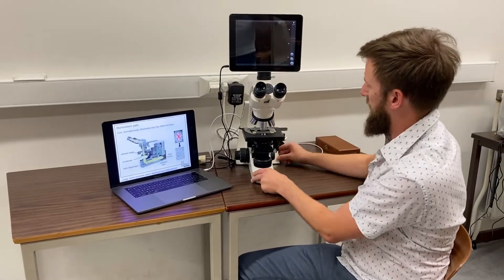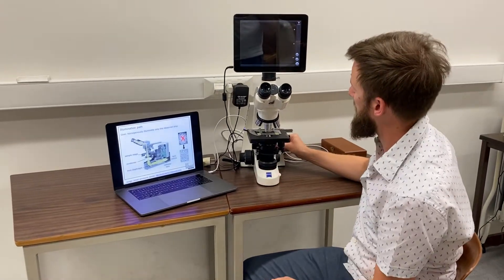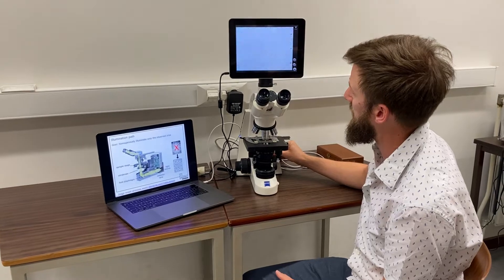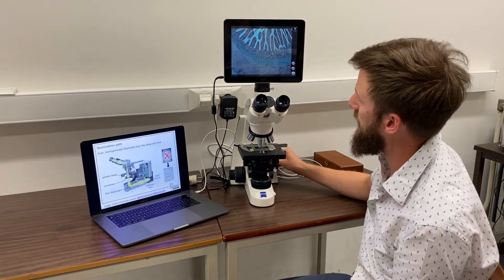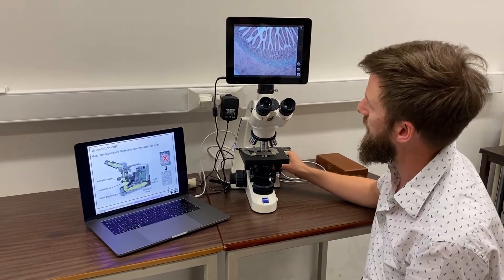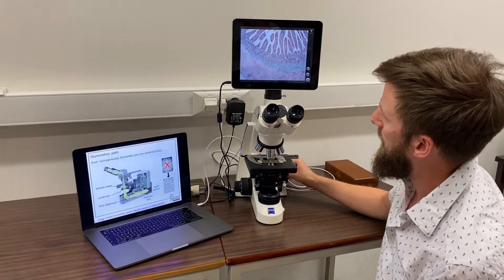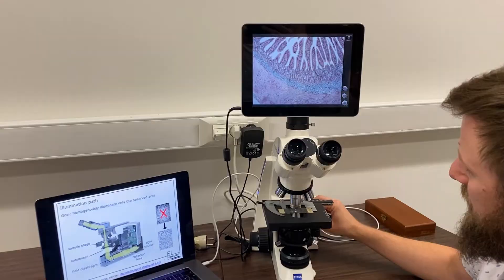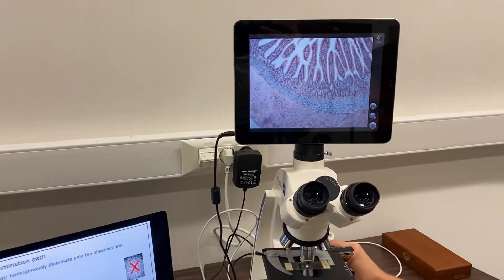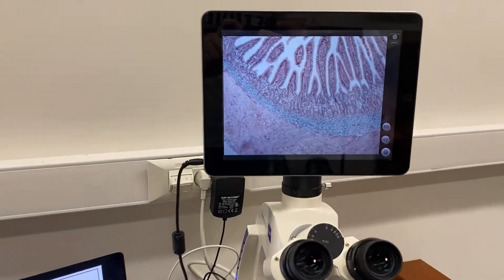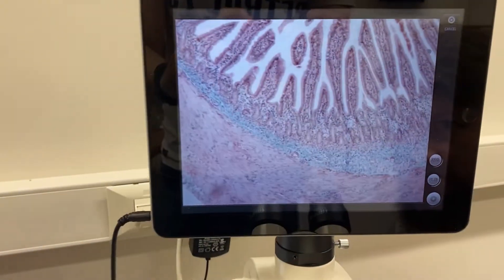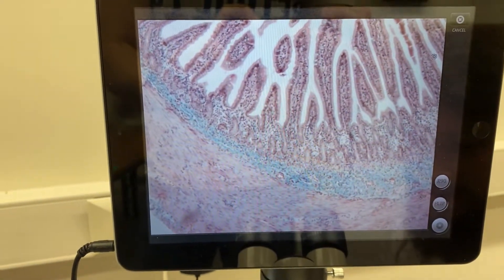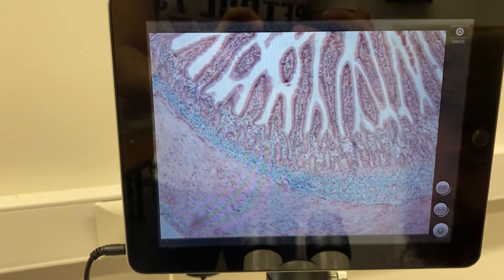So I turn on the lamp. I have a sample here on the microscope, which is a small intestinal sample. With the on/off knob I can change the intensity of the lamp at the sample, as you can see here.